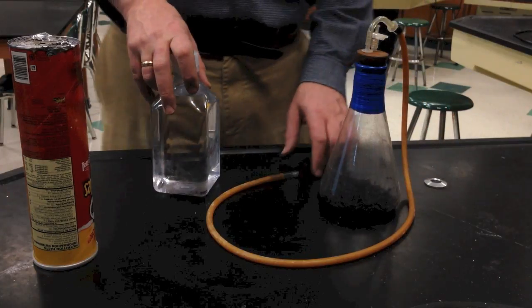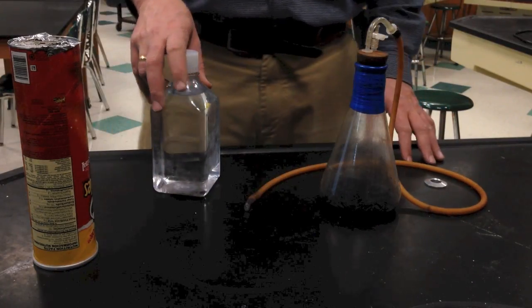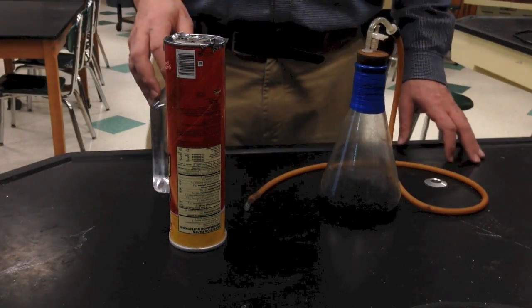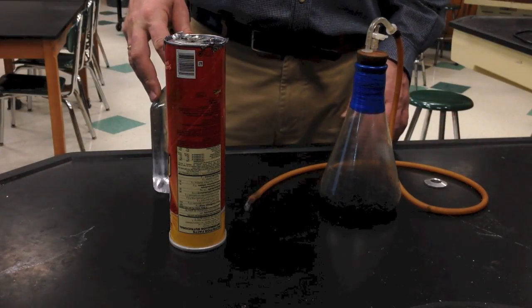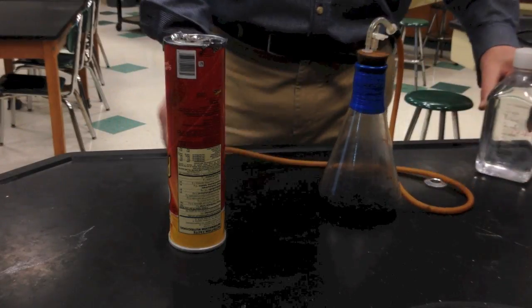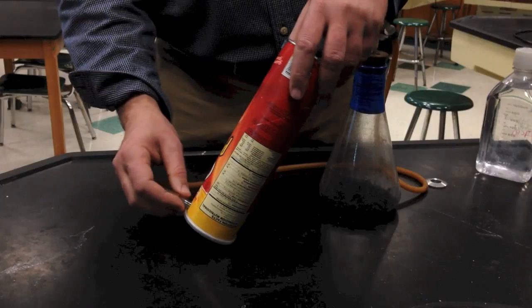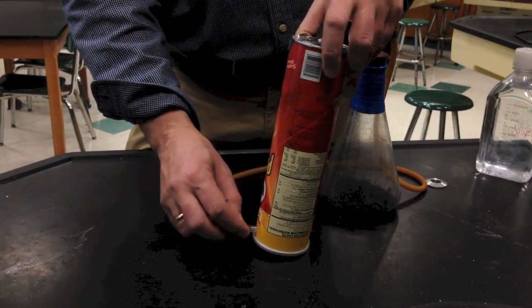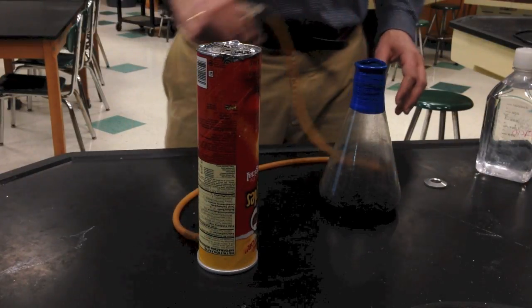And of course, hydrogen is flammable. It reacts with oxygen, but only with the right ratio of oxygen. So if you've balanced your reaction in class with H2 and O2, you'll see there's 2 hydrogen molecules for every 1 oxygen molecule. Any case, that's the reaction we're looking for. What's nice about this reaction is it'll only occur when we approximate that ratio. So I'm basically attaching the tube into my can here, and I'm going to flush this with hydrogen.